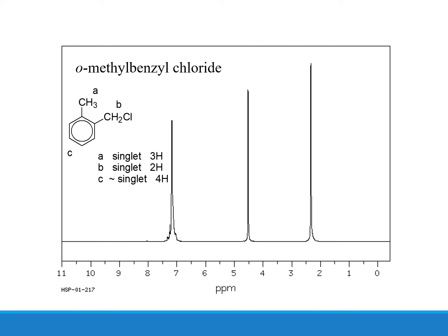The 2 carbons attached with branches in the benzene ring have no hydrogens and do not have any reading, whereas the hydrogens in the methylene chloride are 4 bonds away from the hydrogens in the methyl group. That's why we do not have any problem of splitting here, and all the hydrogen environments appear as a singlet.